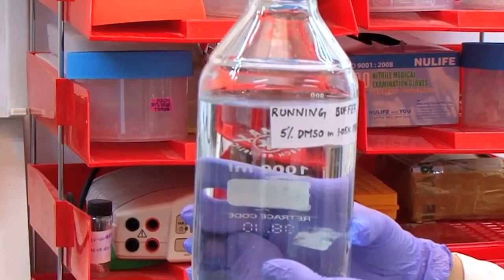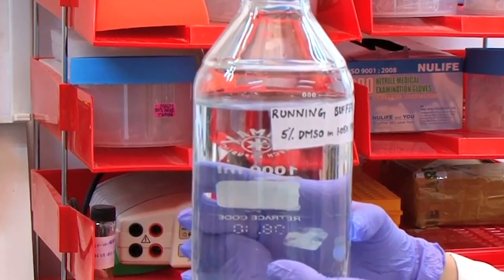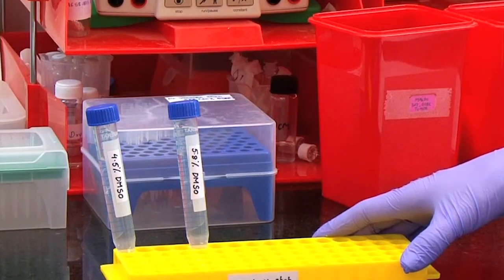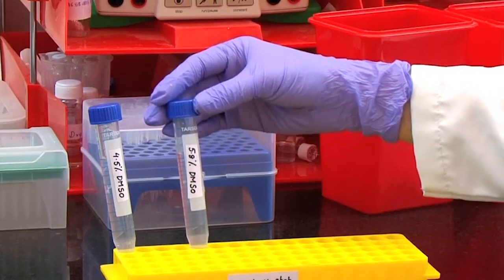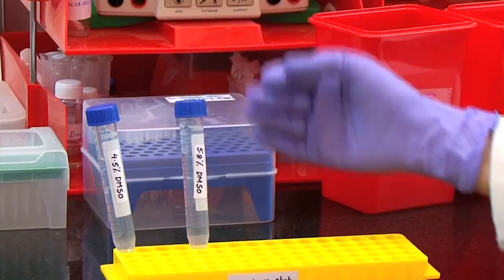We will now work on the reagents required for the screening assay for binding of proteins, human serum albumin and carbonic anhydrase, against several small drug molecules. In this protein small molecule study, we will be using 5% DMSO in 1.05x PBS as the running buffer, which will also be used for the initial startup cycles. 8 different solvent correction solutions will be prepared ranging from 4.5% DMSO in PBS to 5.8% DMSO in PBS, and these solutions will be prepared by mixing in different ratios as shown here.